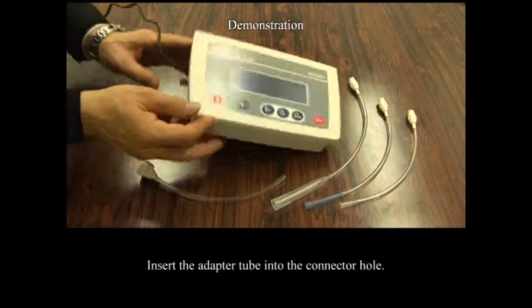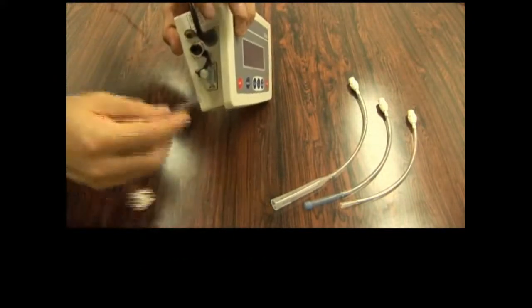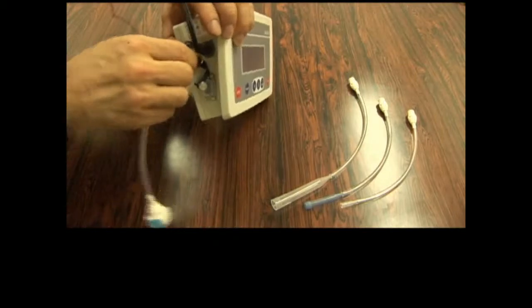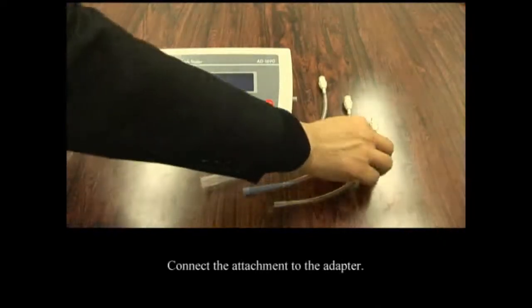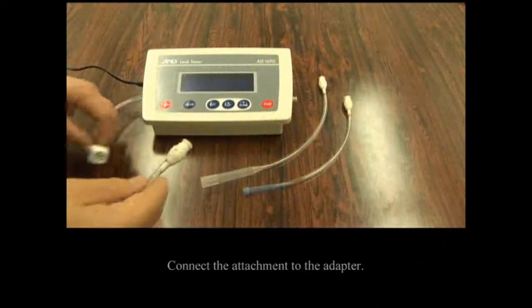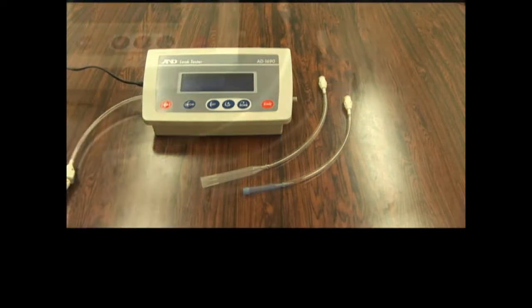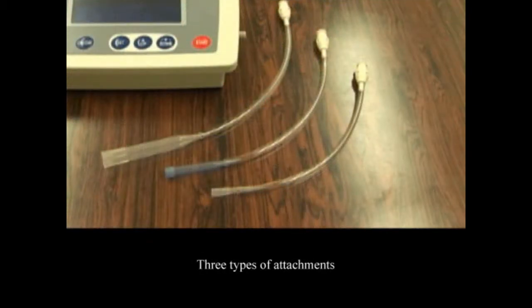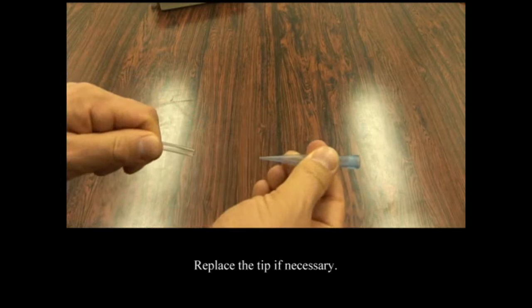First, remove the air plug and insert the adapter tube firmly into the connector hole. Next, select the attachment with the tip that matches the size of the pipette, and then connect the attachment to the adapter. The AD1690 includes three types of attachments to cover pipette capacities ranging from 2 microliters to 10,000 microliters. If your pipette does not match up with any of the attachments provided, replace the tip of the attachment with a tip that matches the pipette.